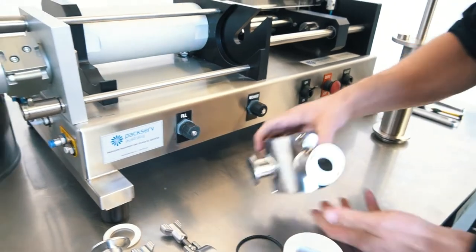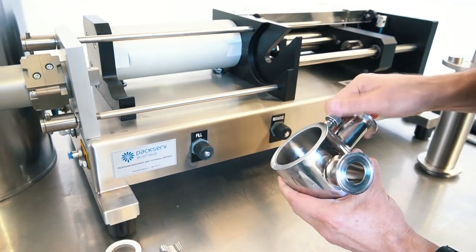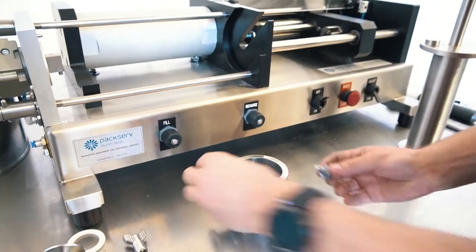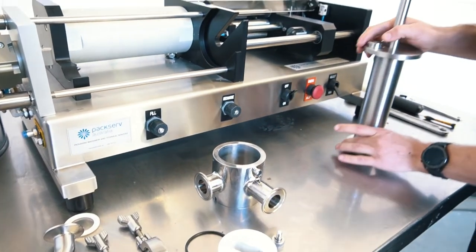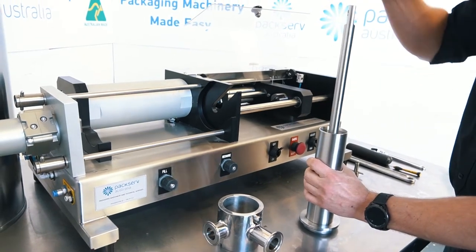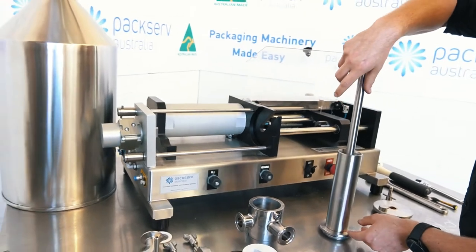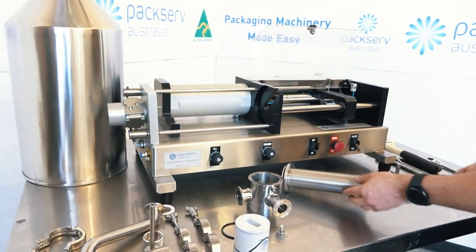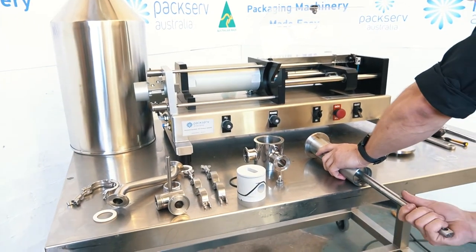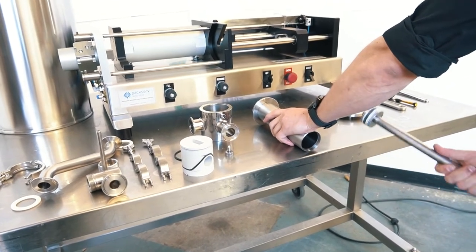The only other part here is the suck back pin, which literally just screws out — just anti-clockwise like that. Moving on to the product cylinder, I've got the end cap here which will just slide off. Next I've got my piston rod inside. One of the easiest ways to get this out if you're having a hard time is to put it on the edge of the table, hold this in place, and then wiggle it up and down until it comes out quite nicely.